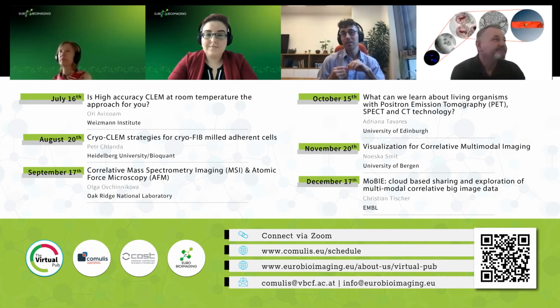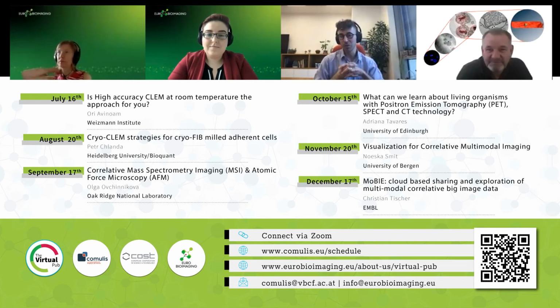But definitely, I think that if you cryo-immobilized and now you are doing super resolution and your sample doesn't look like it's been cooked in the electron microscope, you can be reasonably confident that it represents sort of the ground truth, the actual native or semi-native state.